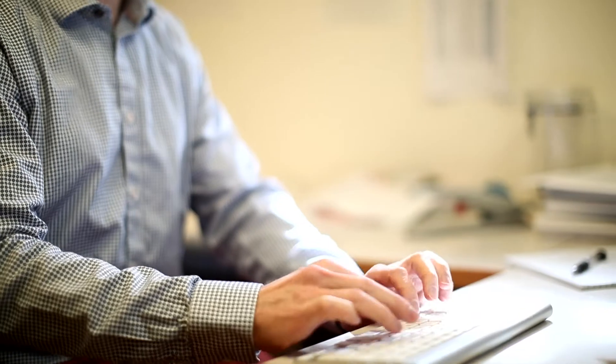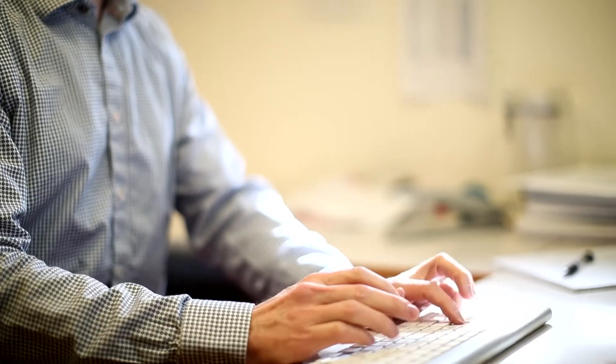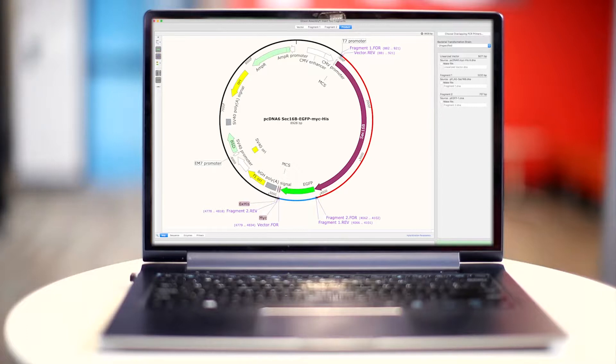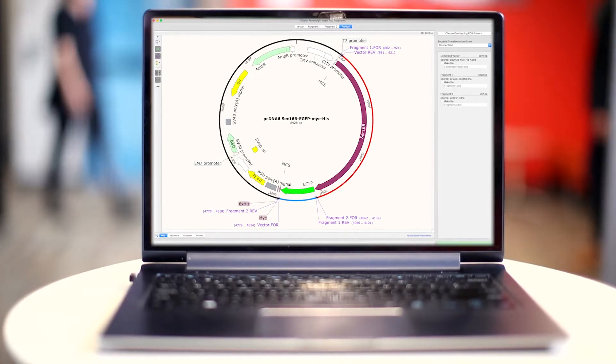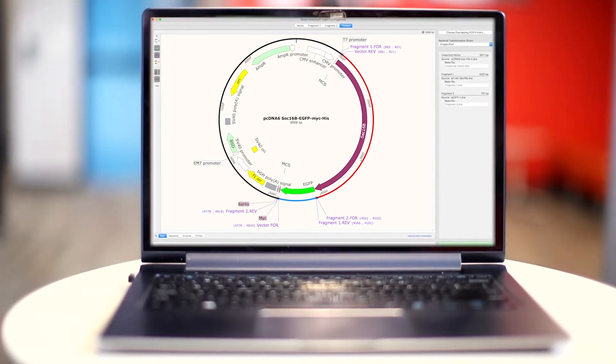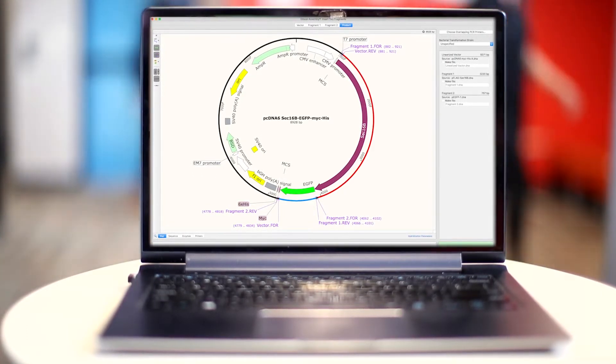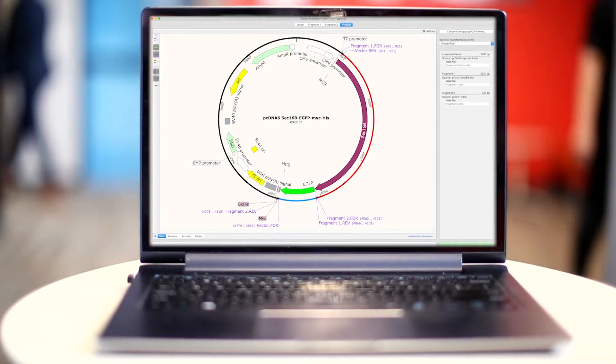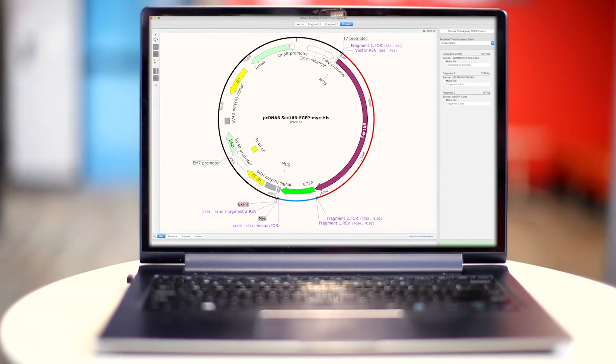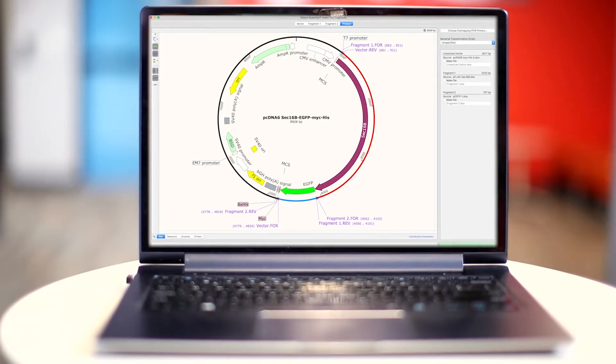And the final problem is documentation — keeping records of these procedures. SnapGene automatically records every step in a simulation and gives you a graphical history of what you've done, so you have full electronic records of every part of your procedure.